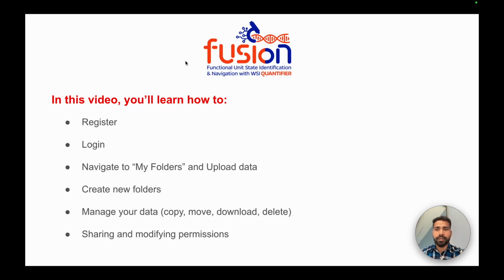Welcome back. In this video, I will walk you through how to get started with Fusion 1.0, including how to register, how to log in, and navigate to My Folders, which is your storage space, and how to upload data, create new folders, and manage your uploaded data, such as copy, move, download, or delete. And also I'll show you how to share and modify permissions of the folders or files.